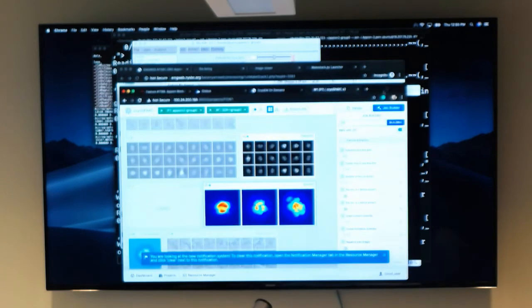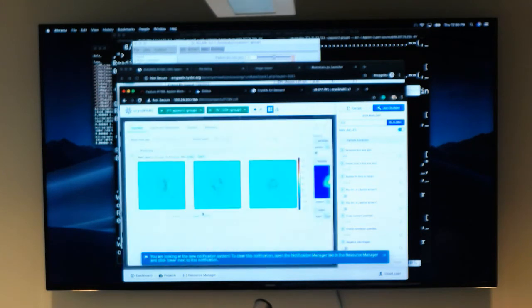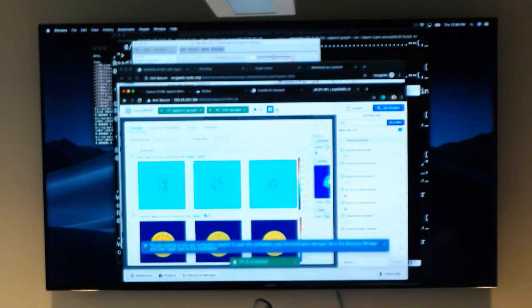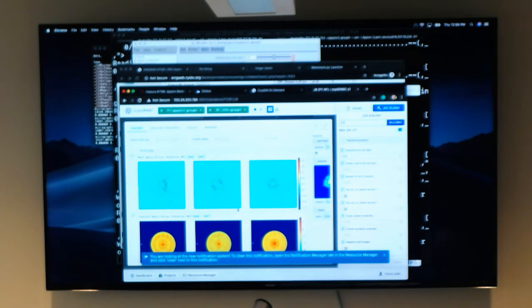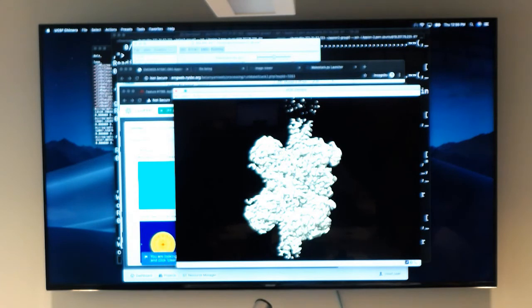And you can see in your tutorial there are some additional things you can do. If you're able to get a 3D reconstruction, you can ask: is this the right hand? Because we are using projection images, there's no guarantee that all your helices are the right hand. If you can see helices, you can probably just look at it outright, but there's a chance that it parses your data and you get the wrong hand. So given that I told you this is GDH, you can download a PDB, and if you have Chimera, you can open it up and match it to see, does it match? Or maybe the reconstruction we have is a different conformation, a different state, which might differ from another PDB or EMDB entry of this molecule in the database.